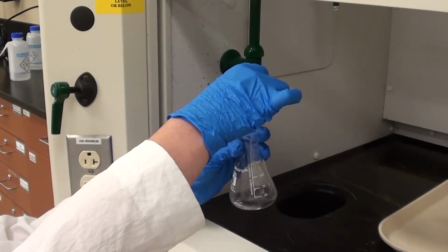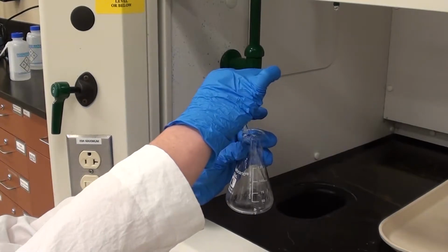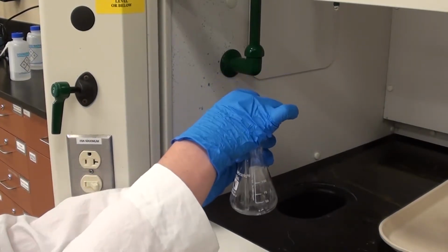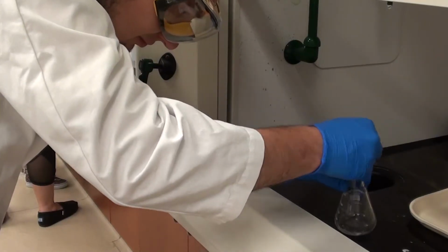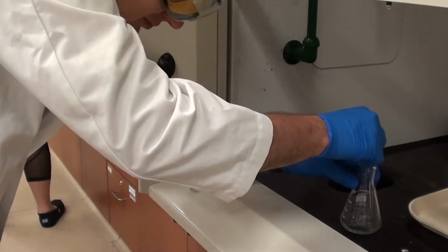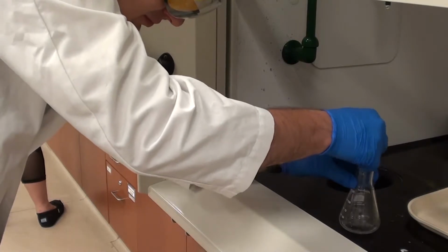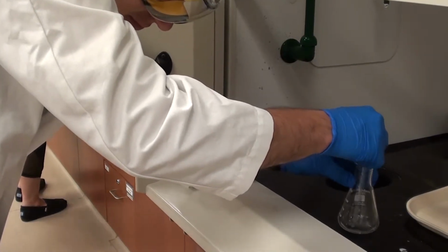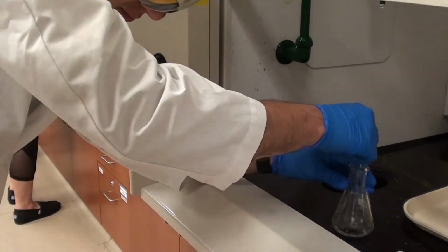And what will happen is eventually aspirin will start to pop out of the solution and it will become slushy, and that's what we're waiting for here. But you do see that it is fairly clear right now. As you can see, the solution is now pretty much clear, but you'll also notice that where Cassidy took the stirring rod and sort of painted the walls a little bit, you can see that there is a bit of solid forming on the side there.